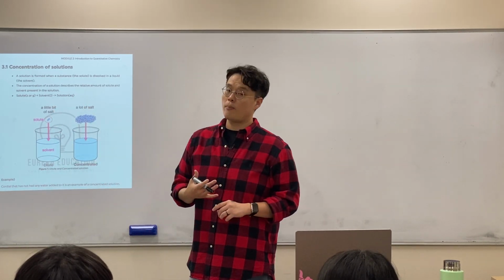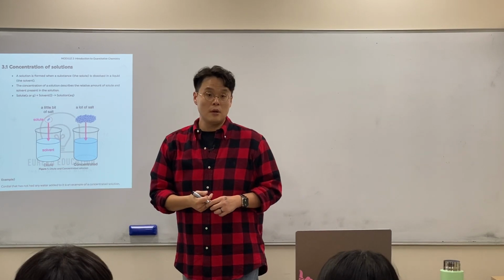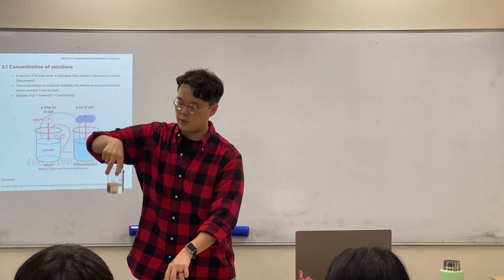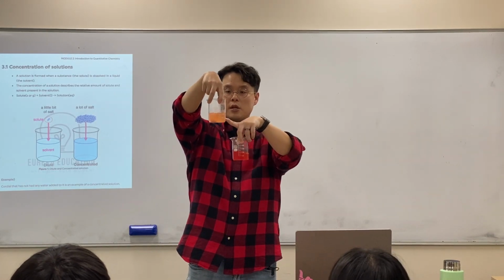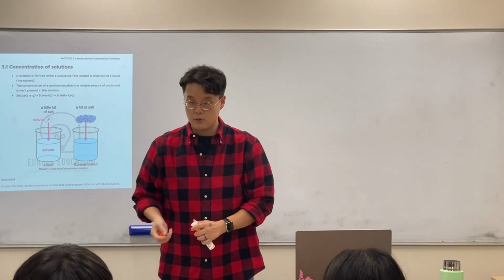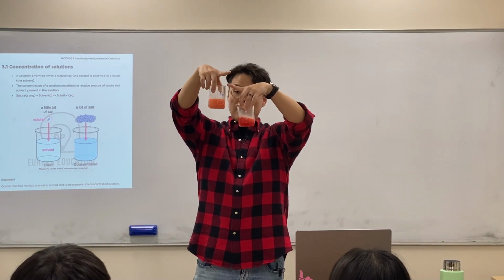Today we're going to talk a bit more about quantitative analysis chemistry and how we determine something called concentration. So I'm going to make another solution here. Showing you the second solution, I put one tablet each, and you're seeing it turning into solution form here as well. Whilst we're waiting, I'm going to put another tablet into the one that Haley made. So I'm making the second solution here. This one has two tablets. This one has one tablet.